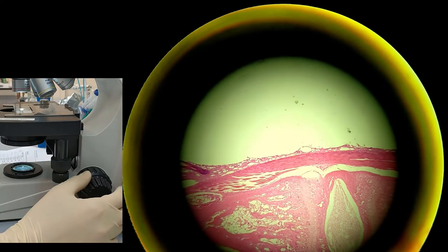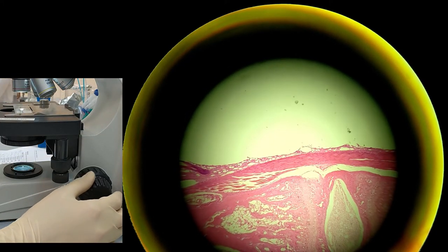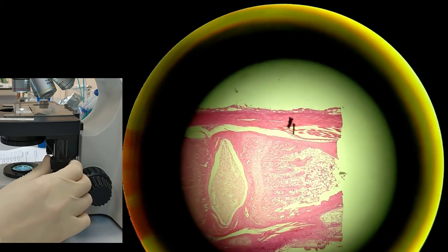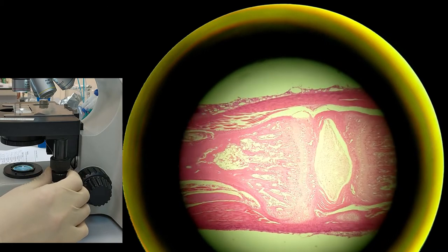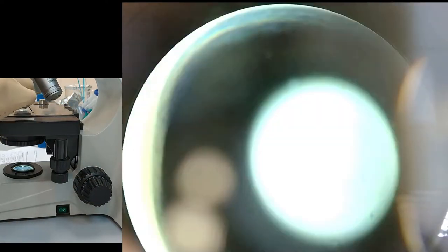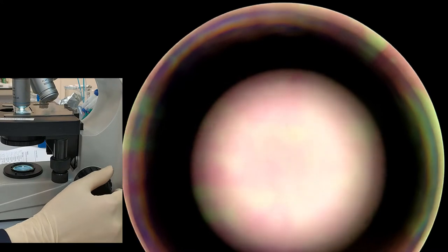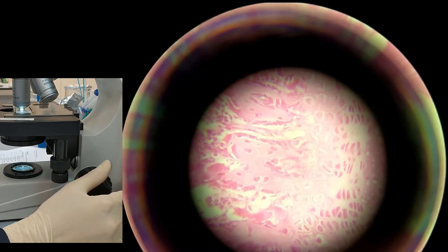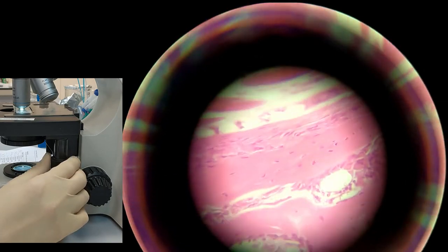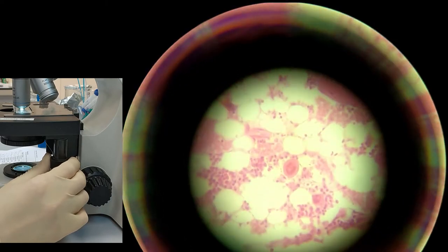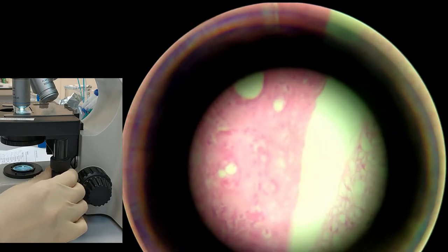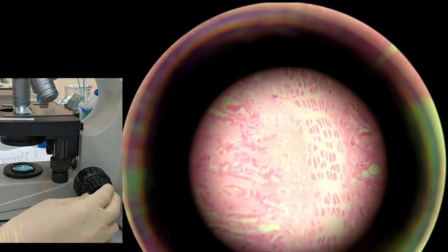Next, we have the bone marrow. You can see the cartilages here, and after you define the place that you want to draw, you can start drawing. So between these trabeculae, we have blood stem cells that produce all of our blood cells. Define the place and draw it.